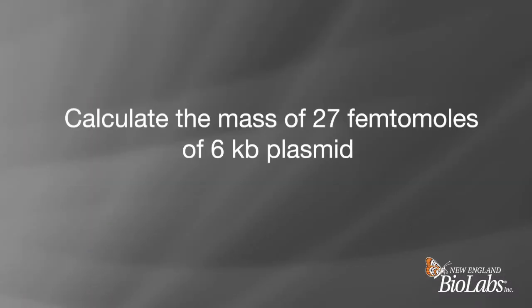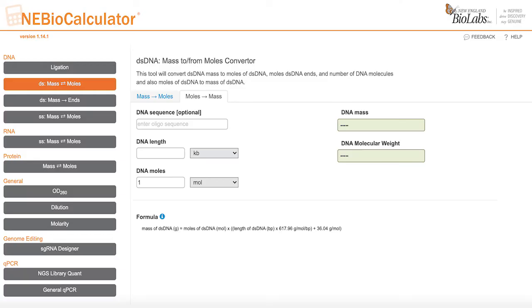We will now calculate the mass of 27 femtomoles of a 6 KB DNA plasmid. Click on the double-stranded DNA mass to moles option on the left side of the tool. Then, click on the Moles to Mass tab.